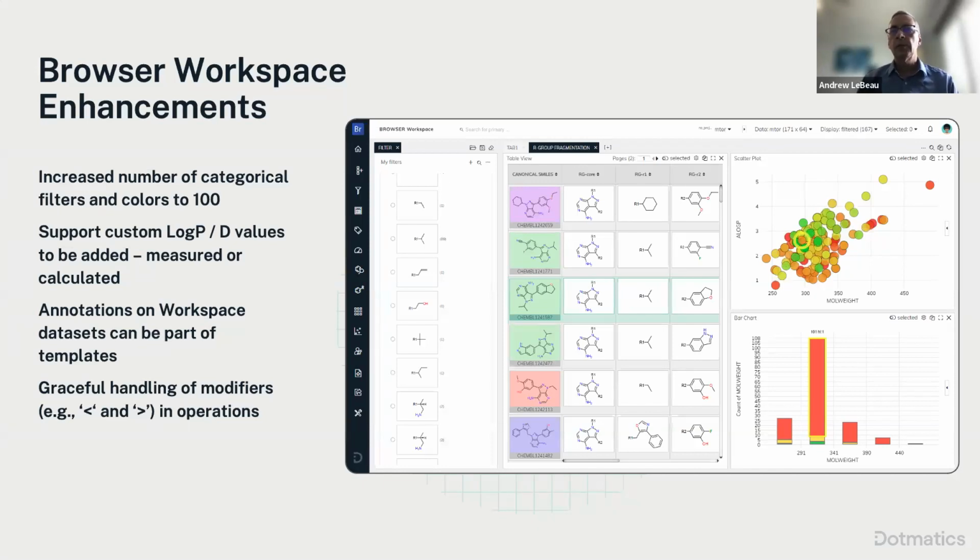And it's really important because you're often using the same templated analysis on different data sets. And so now you can take those annotations and keep them as part of a template and apply it to a new or an extended data set without losing them. Again, really importantly, capturing those insights, capturing the interpretations, so that they're not lost as we add to a data set or work with a different data set.